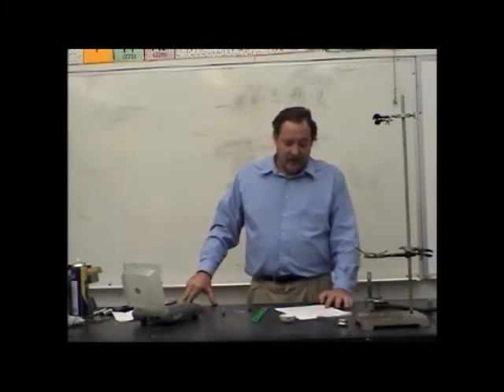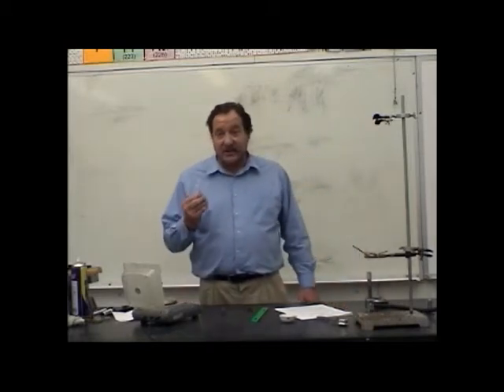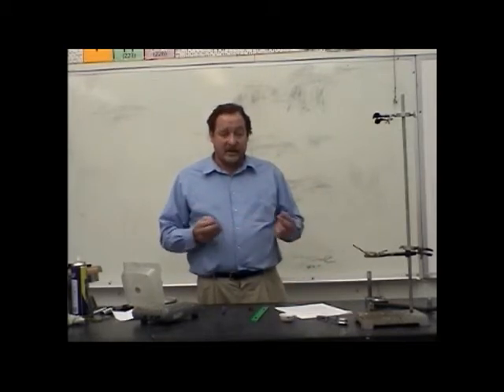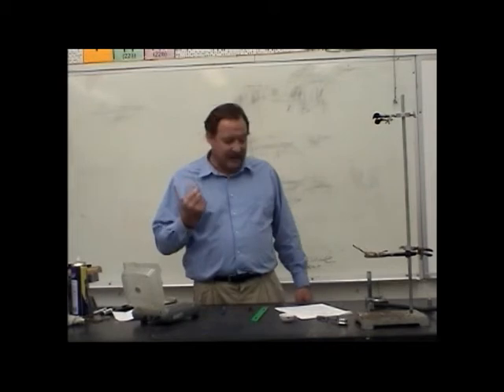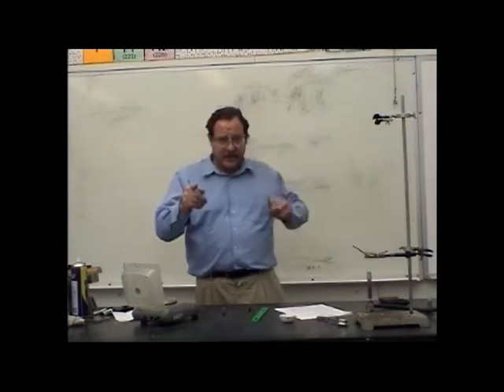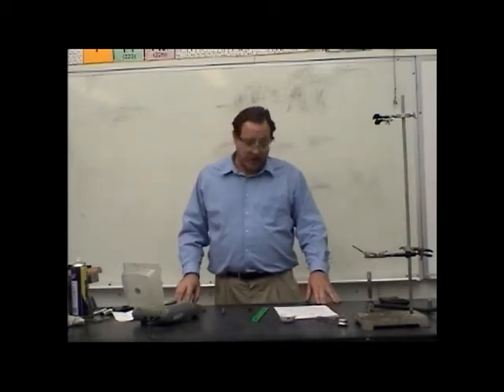Now, when you're performing this combustion reaction, make sure you do not stare at the magnesium strip. It burns very bright and it could burn your retina. Odds of that happening are pretty slim to none, but still, for your safety, don't stare at the burning magnesium strip. Okay, putting on my safety glasses, just as you will. Safety first.